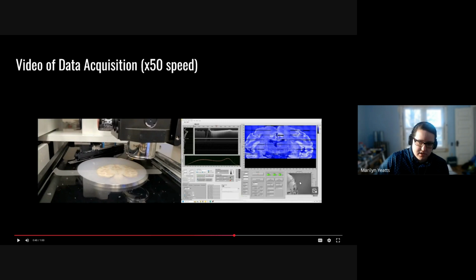This is the compilation of these. As I'm going, whatever tile I'm on will show me here, and then it will pop up in here when it's done. While the next one is scanning, I'll have the previous tile visualized until we go to the next one and it will switch. So those are the graphs that you can see in this image. Does that make sense? Does that answer your question? It sure does. Thank you.